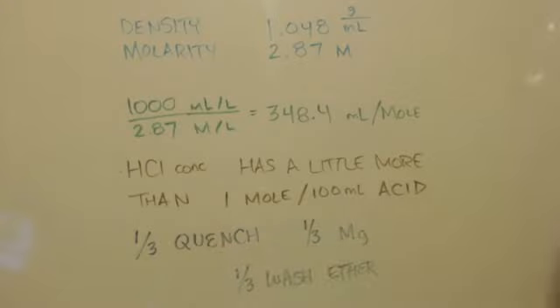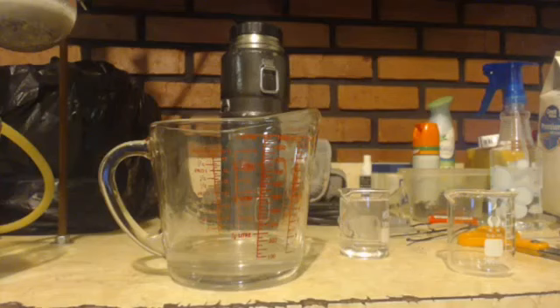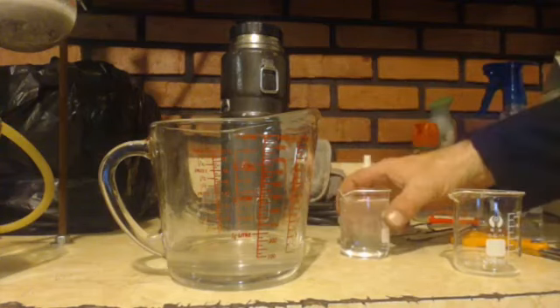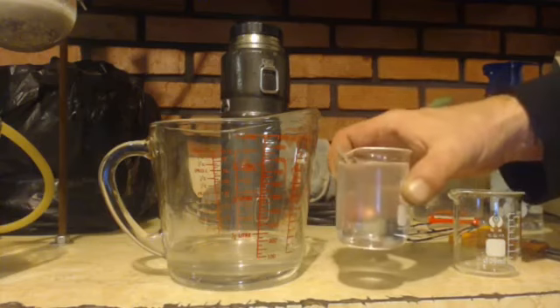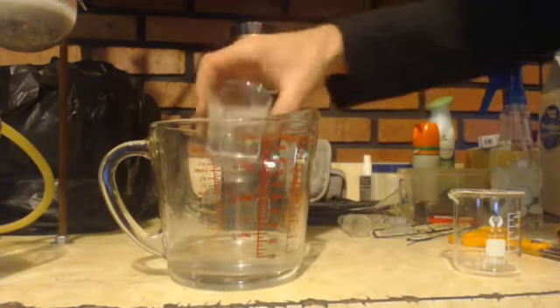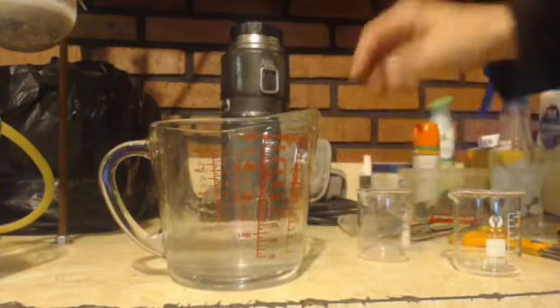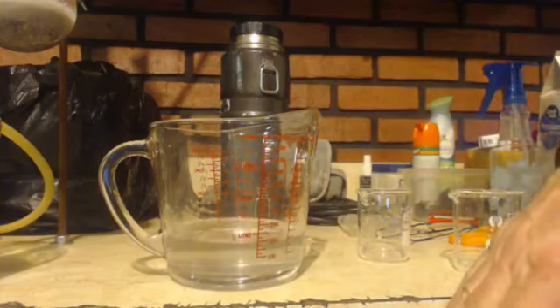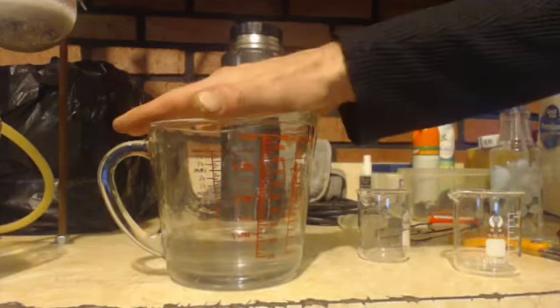A third of it I'm going to use to quench, a third of it to destroy the magnesium metal that's left over, and a third of it to wash the ether. Although this last third, I forgot to do. So I still have the third of hydrochloric acid I didn't use. So we'll make my 10% hydrochloric acid. I have 90 to 100 milliliters of concentrated hydrochloric acid here, 100 milliliters of cold water here. I'm going to mix them together. Then I'm going to add more water so that this goes up to 348 to 350 milliliters, okay? That way I'll know that it's 10%.